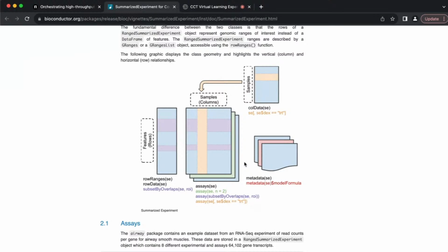And if this is your first time thinking about this kind of object, this picture here will likely not make a huge amount of sense. However, when you start to play around with these objects, I strongly encourage you to keep revisiting this image, because I promise you this will help. This will help produce a mental model of this object type that is really, really useful.